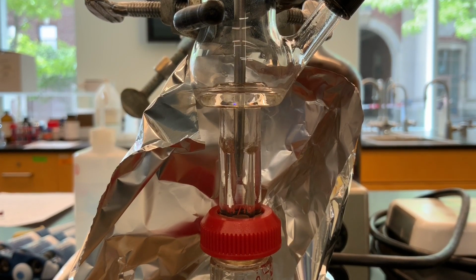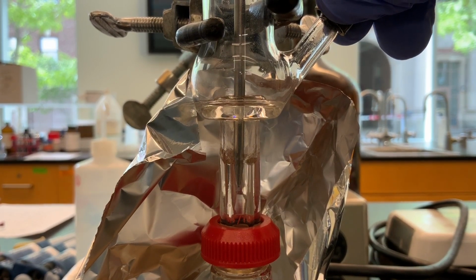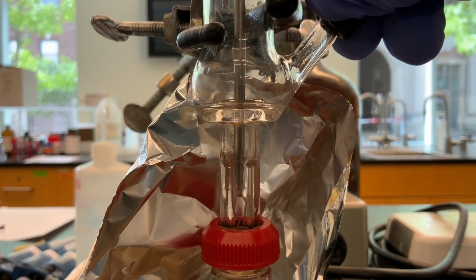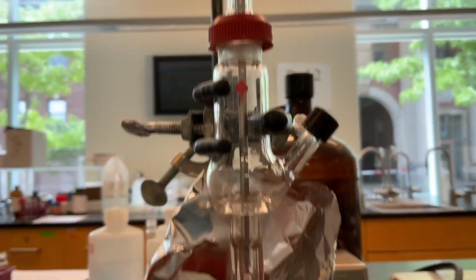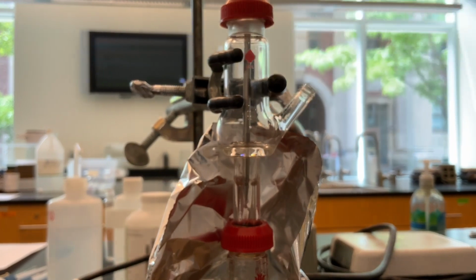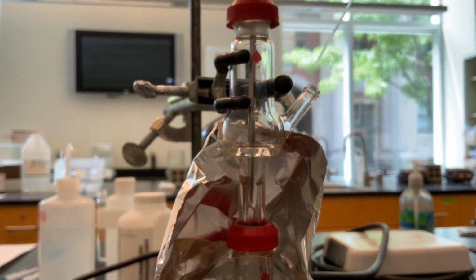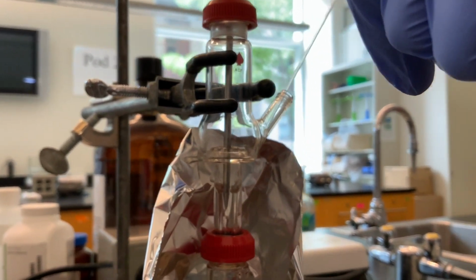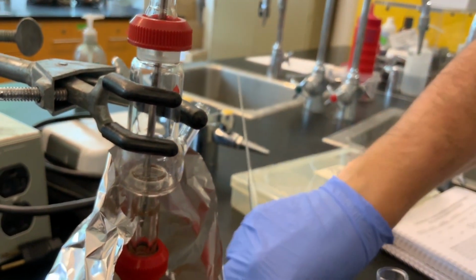So now we're reaching the territory where it's going to start overflowing. So this is a good point to now collect the first fraction. So we're going to unscrew this. We're at 78.4 right now. And so remember, it's volatile, so I want this close by. And now that's fraction number 1.